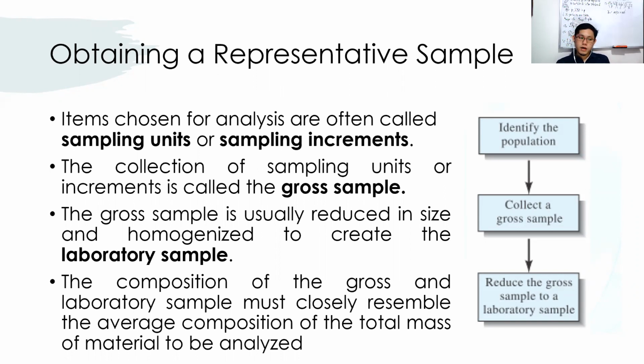So, if you have, halimbawa, 10 kilos of eggplant within different markets, pwede mo naman siyang pagsamasamahin into a gross sample, pero para ma-sure ka na talagang represented and uniform. Hindi ka din magkakaroon ng bias kasi syempre mas mahirap mag-random sampling kapag big solids na yung gamit mo. So pwede mo siyang i-homogenize into a powder. So doon, wala ka na magiging bias sa specific eggplant fruit.